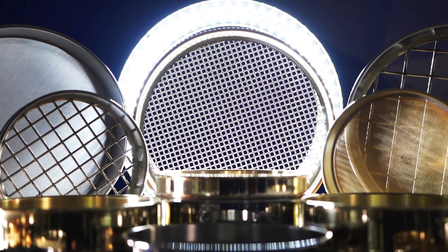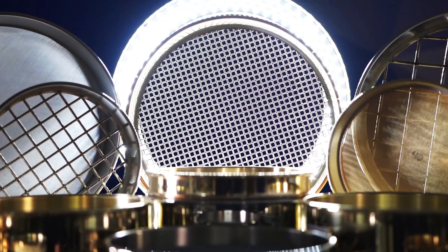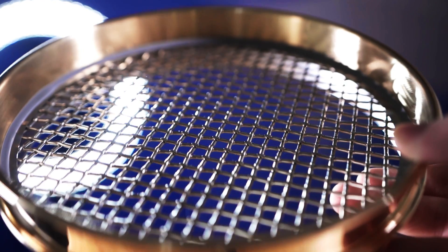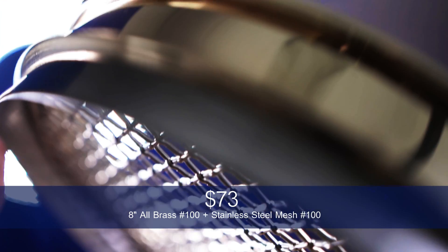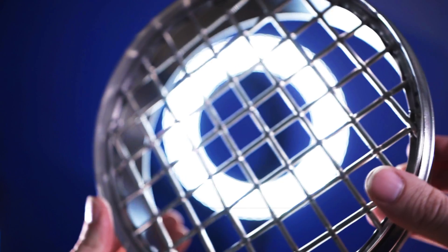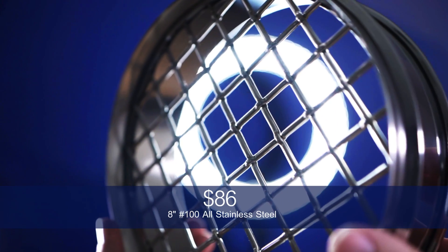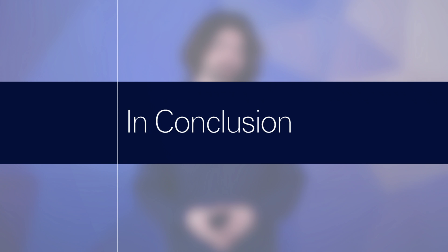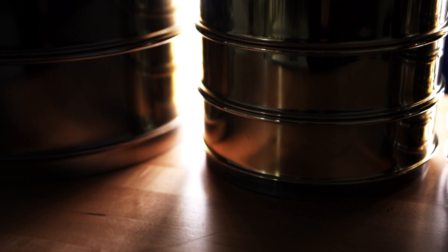Our brass frame test sieves, whether they contain brass or stainless steel mesh, cost relatively the same amount to purchase. For example, an 8-inch all-brass No. 100 test sieve with a brass frame and stainless steel mesh costs about $73. The 8-inch No. 100 with a stainless steel frame and stainless steel mesh costs about $86.